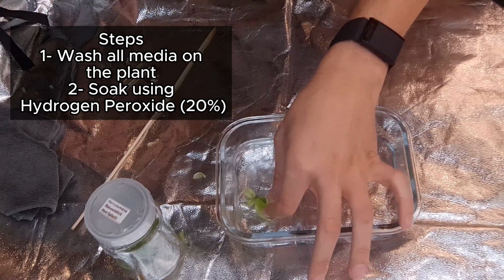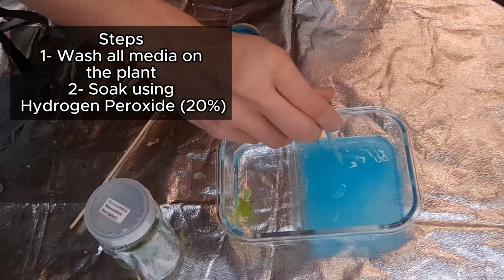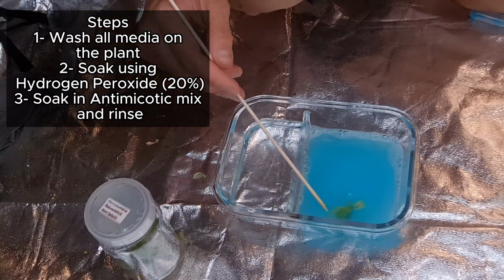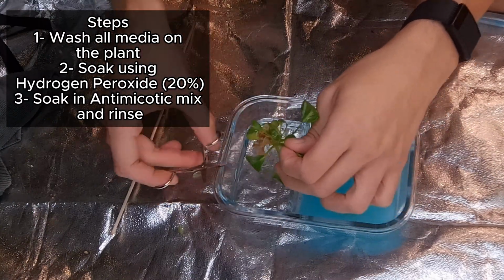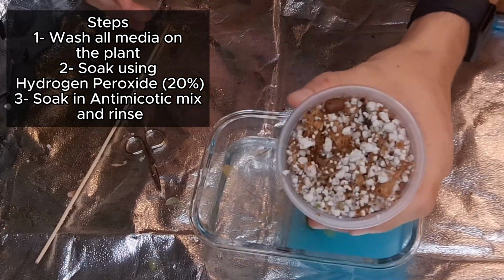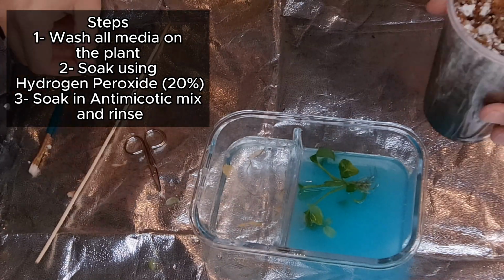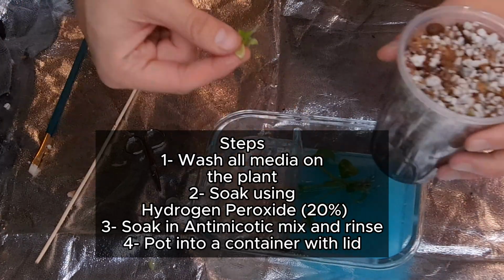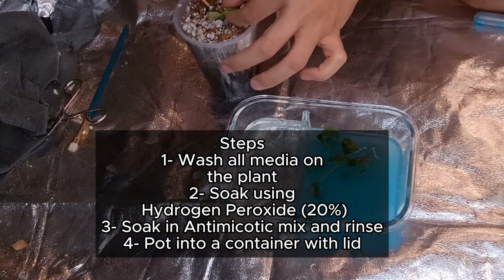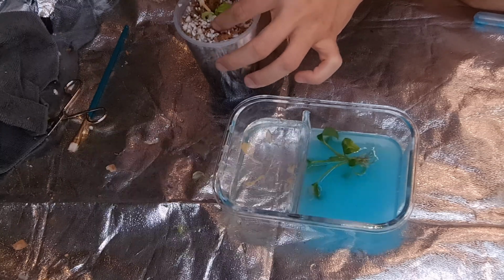Just see if anything is bubbling. If everything looks fine, then you can just move it to what I use, like copper. This is just a tiny little bit, it just turns really blue. And then you're gonna put it in there for like 5 minutes. I usually just do it while I'm doing something else, almost like an assembly line. And then once it's been 5 minutes, you can either rinse it out again before putting it in the pot, or you can put it directly, however you feel more comfortable. You do a little opening in the middle of the media, just place it really gently, put the lid on it, and then close the holes with some tape.